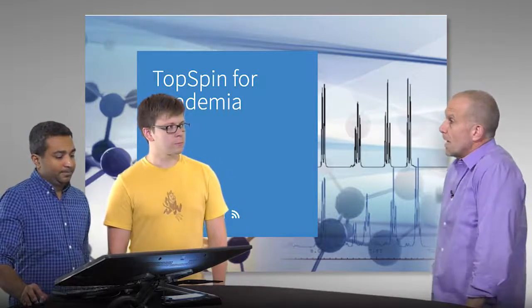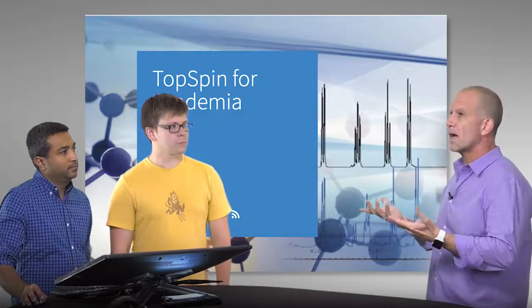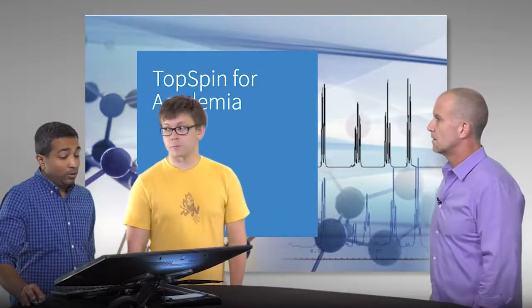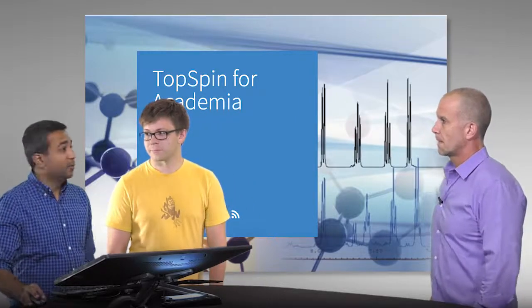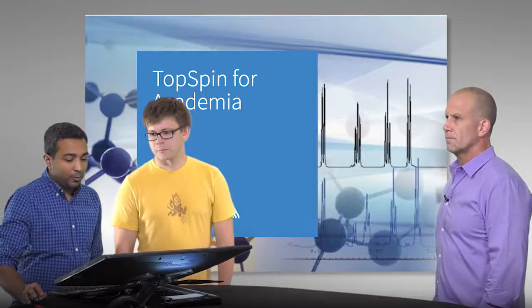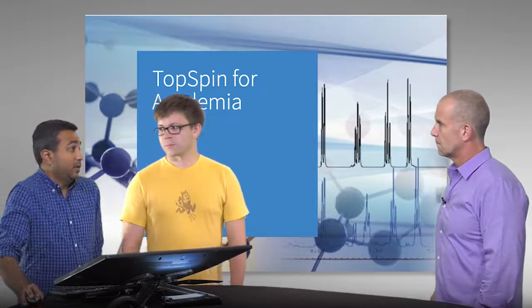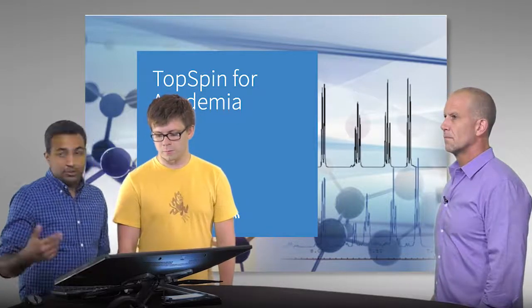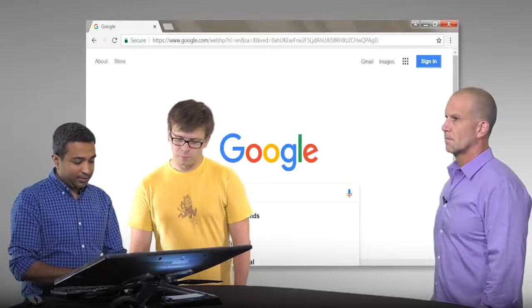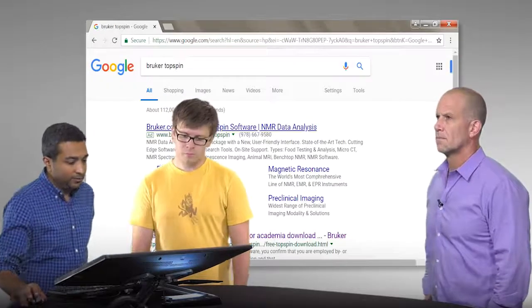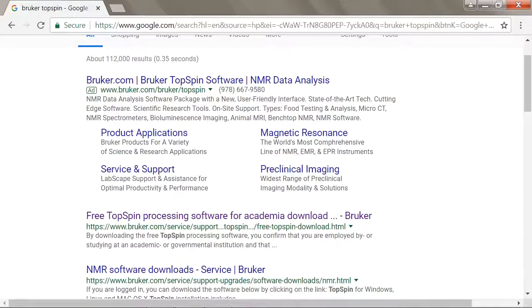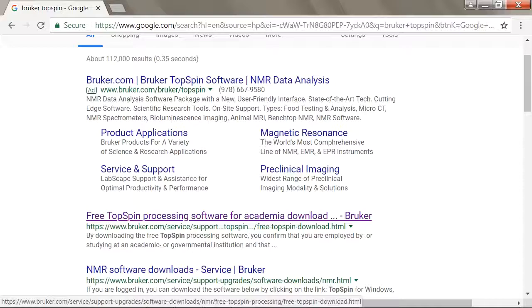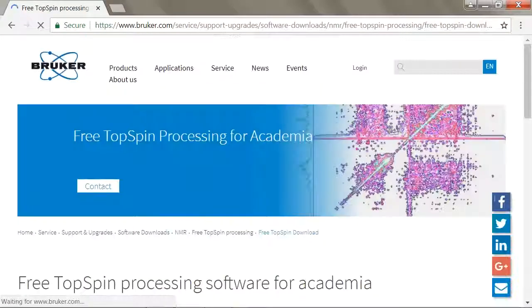So it starts with being able to get this software. And so where would I go to be able to find the software and download it? Like most software these days, Bruker just makes TopSpin available online. So the only thing you need to be able to get TopSpin is a Bruker account. The easiest way to get there is just go to Google and type in Bruker TopSpin. It almost helps just to search academic download TopSpin and it'll probably get you to this site directly.